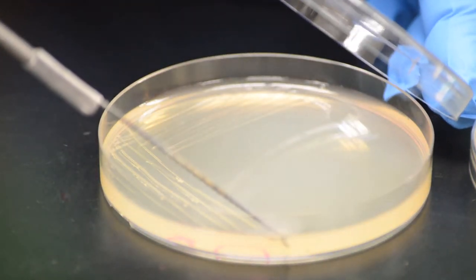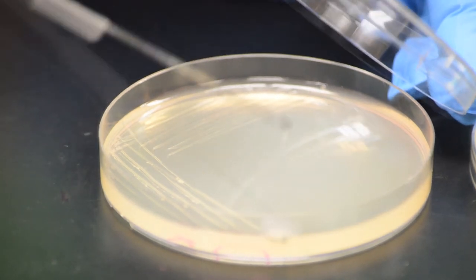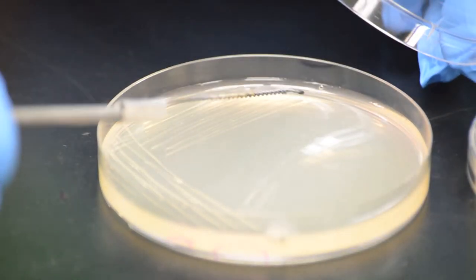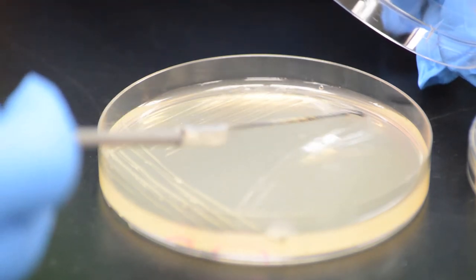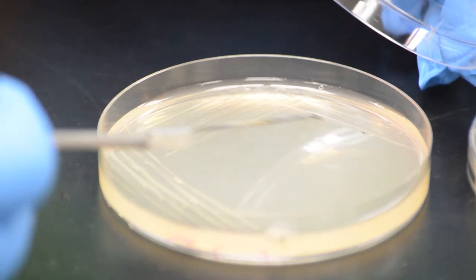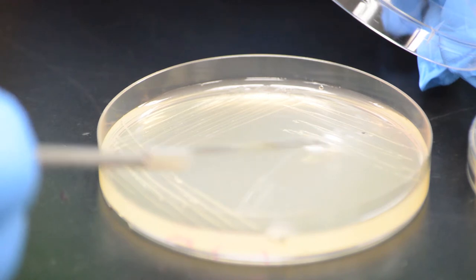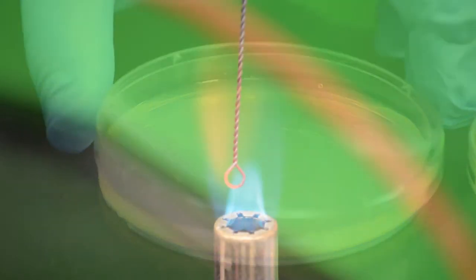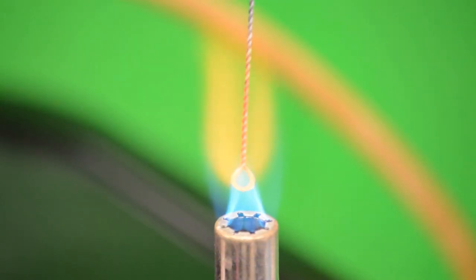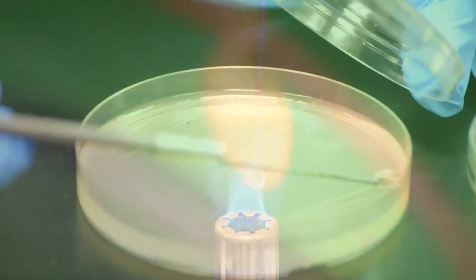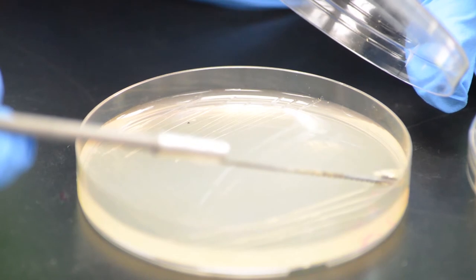Remember, there are many patterns that can be used for a streak plate. In our experience, the best results can be obtained if you only pull the loop through the last streak once or twice. This allows for maximum dilution of the culture; in other words, you decrease the number of cells being spread after each set of streaks.